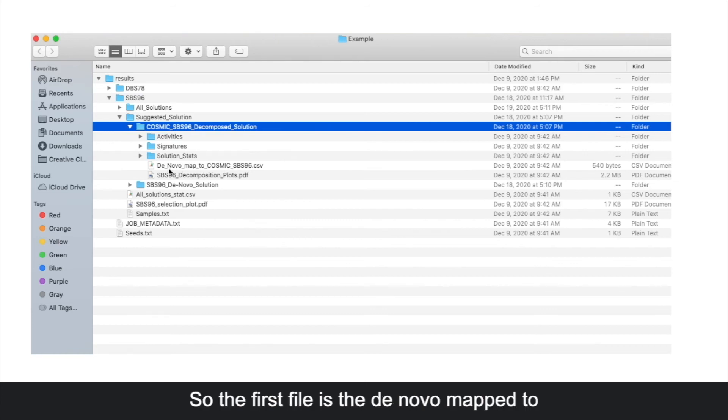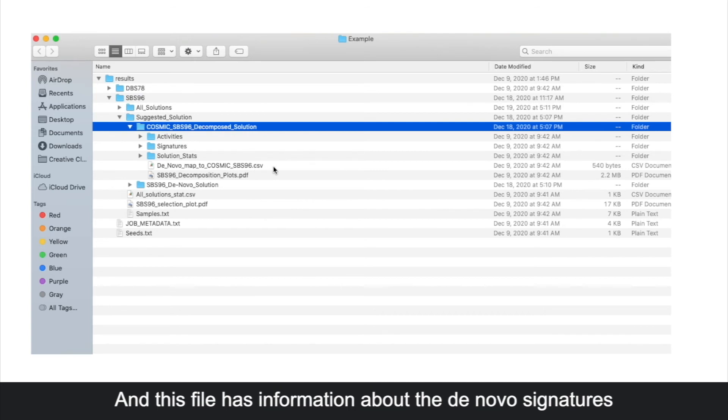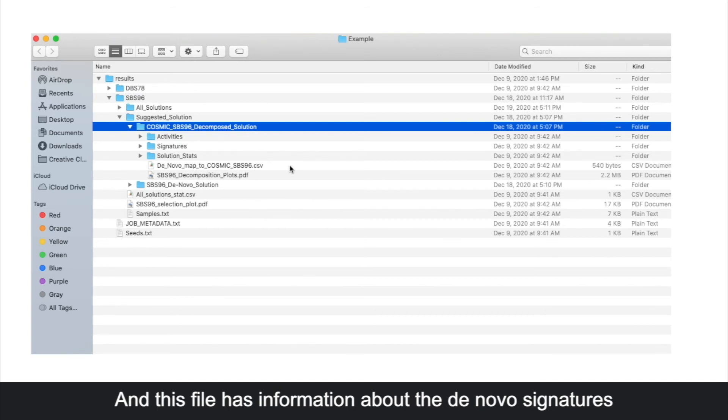The first file is the de novo map to cosmic sbs96 file. This file has information about the de novo signatures and the cosmic signatures that compose them.